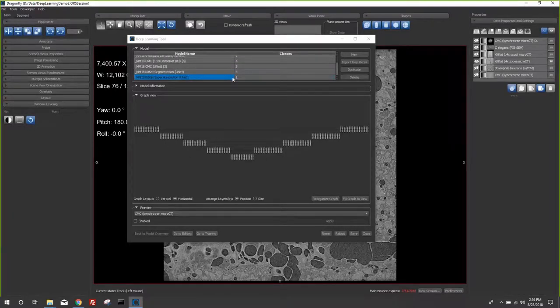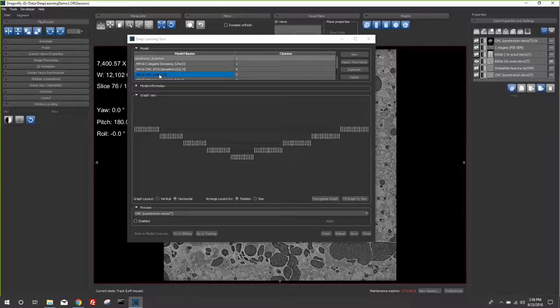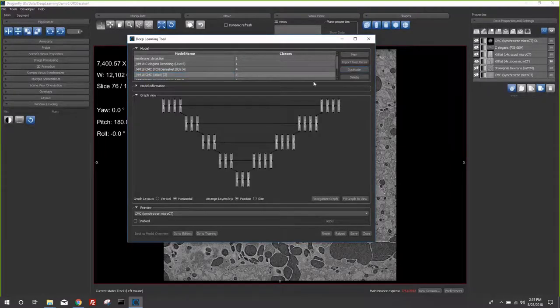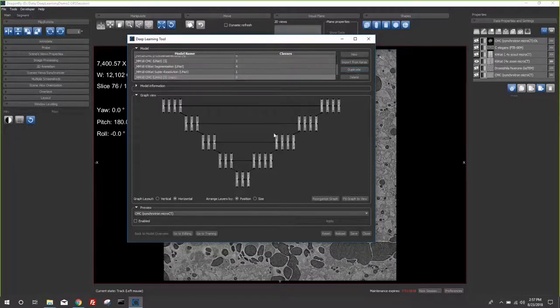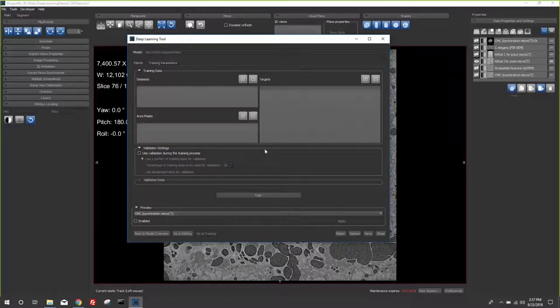To build a neural network model, you often start with an existing one and make a duplicate. For example, I take a model trained on ceramic matrix composites with a UNet architecture, select it to see the topology, and ask for a duplicate. Dragonfly duplicates the entire model in memory and I can name it — for example, 'new KitKat segmentation model.' Then I can go to the Editing or Training panel. The training panel is where you set up and tell the deep learning model how to learn from user examples.